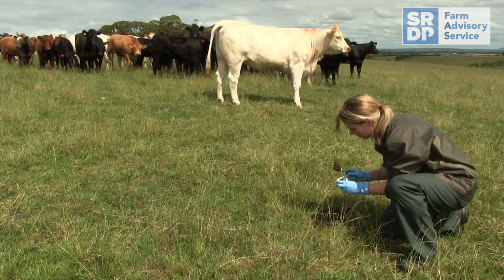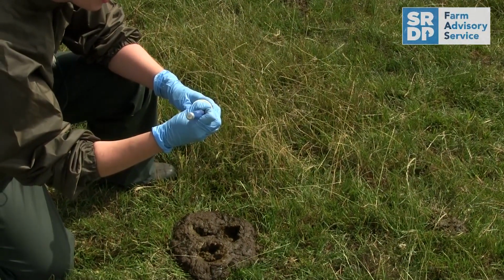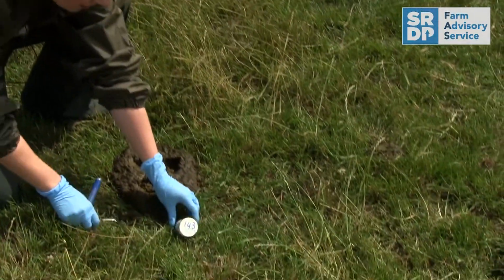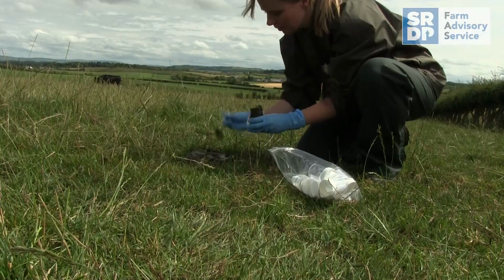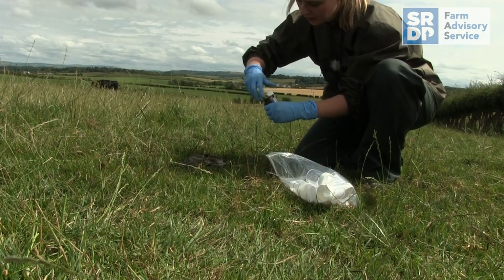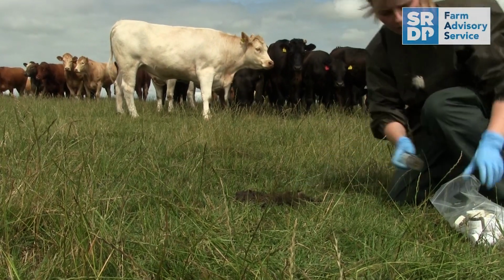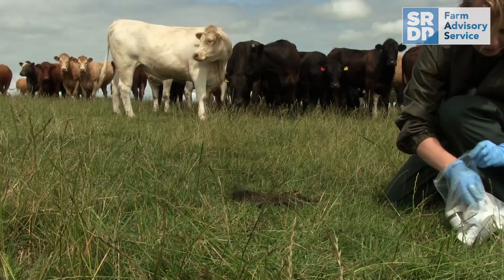You need to label the pots with the animal ID, and if the samples are for routine monitoring, take 10 samples per management group to give you a representative sample of what's going on in that group. Take them to the lab on the same day, or if this isn't possible, store them overnight in the fridge. Make sure you take details of when the group was last dosed and what with.